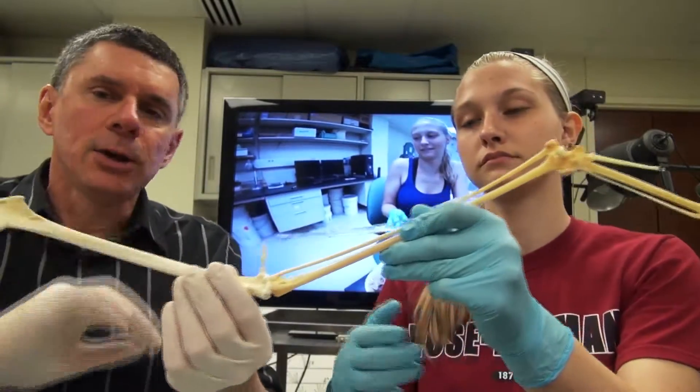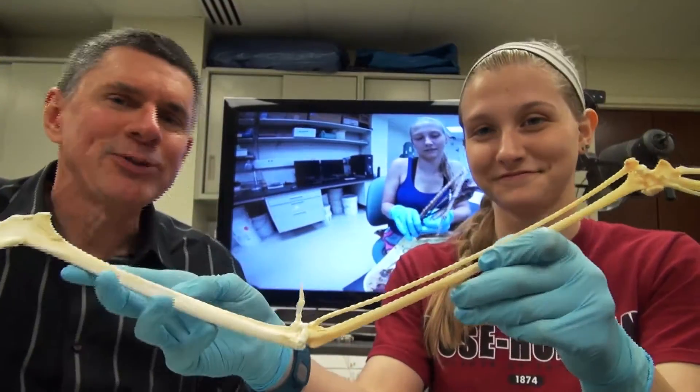We got interested in this automatic flexion-extension mechanism that really all birds have. We were looking at it here in an albatross and really wanted to dig in and see how this automatic mechanism worked. So we actually dissected and then ultimately skeletonized that albatross and then hot glued all the bones together.